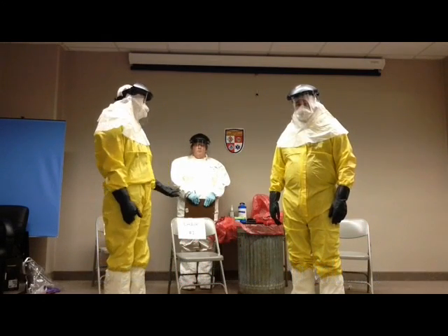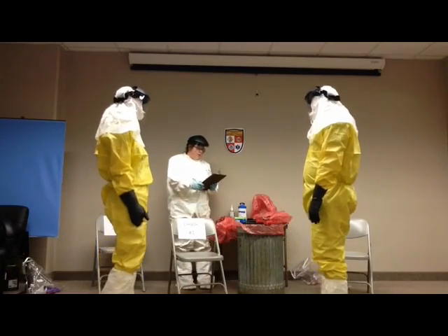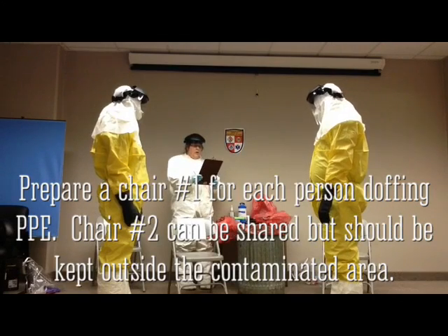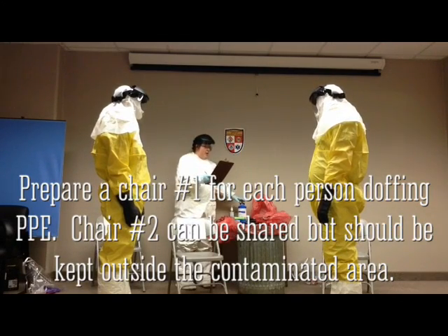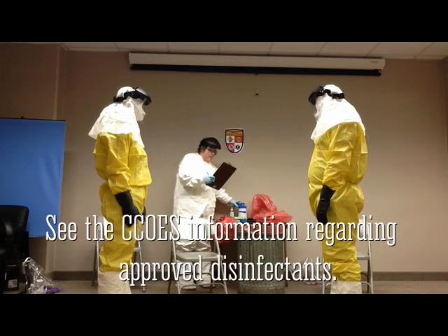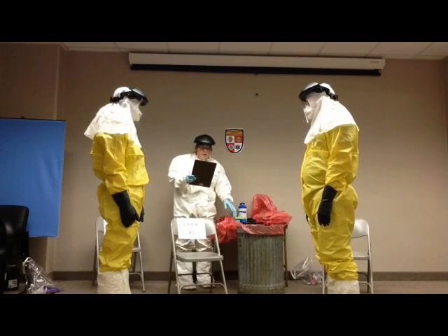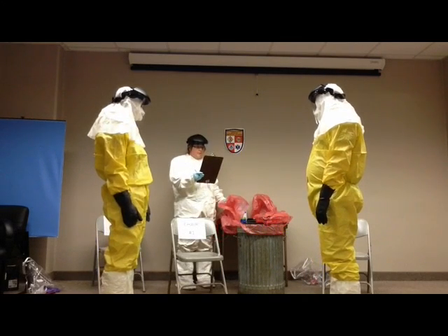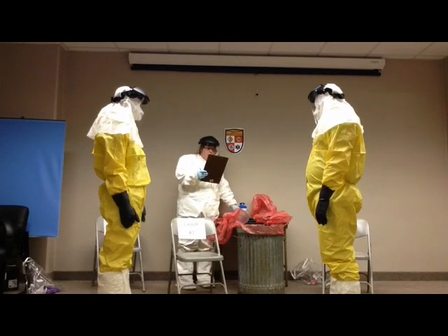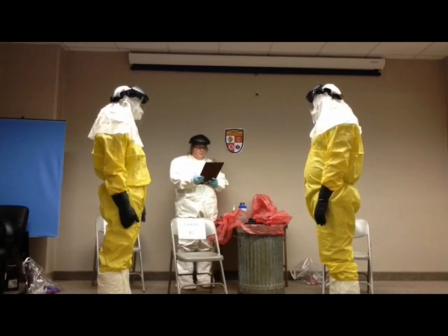Starting first, she will gather the proper equipment as our trained observer. 2 chairs labeled 1 and 2, spaced significantly apart. EPA registered disinfectant wipes or disinfectant spray, alcohol-based hand sanitizer, large garbage can with red bag liner, and 2 large red bags, big enough to put both feet into and doff coverall, and a box of nitrile gloves, proper size for provider doffing PPE and trained observer.